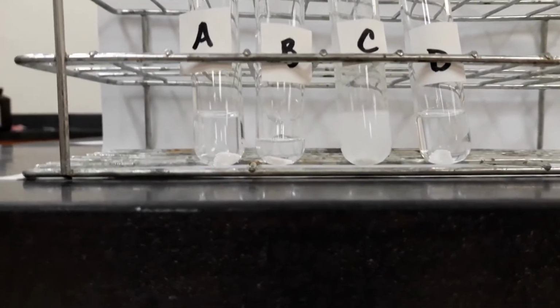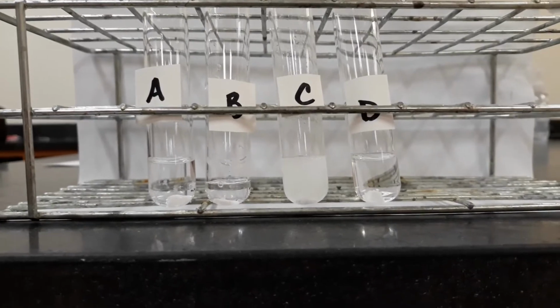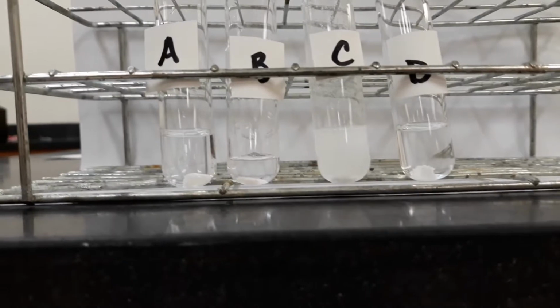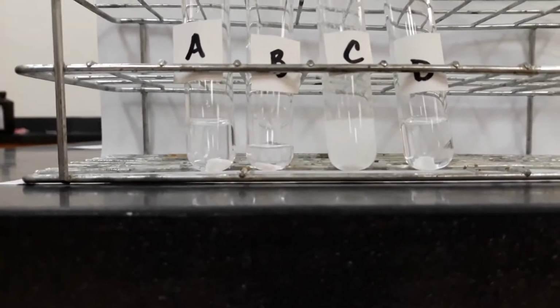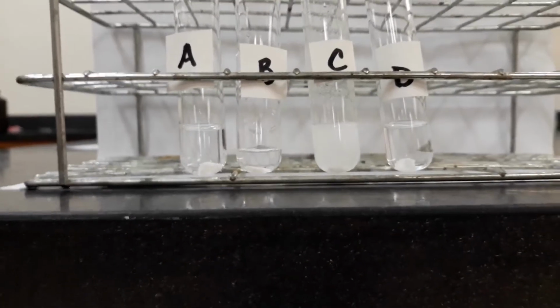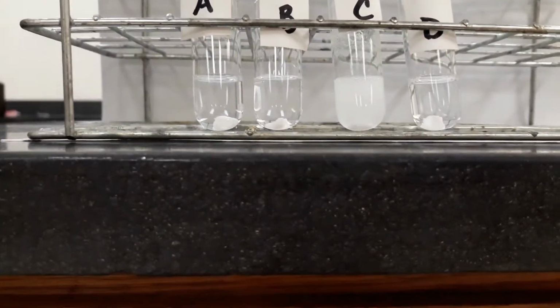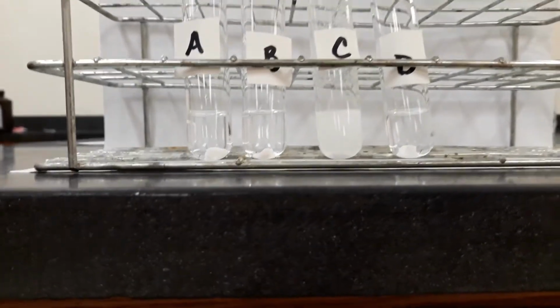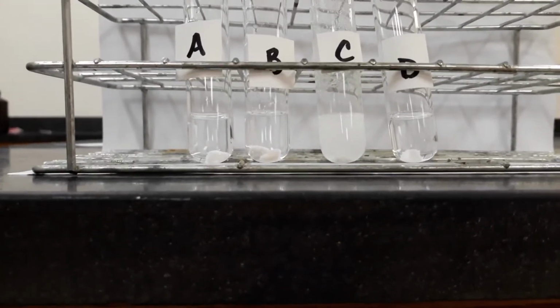We see C is reacting vigorously, and B, well, yeah, there's small bubbles on B. Maybe more solvent. More? There we go. All right.